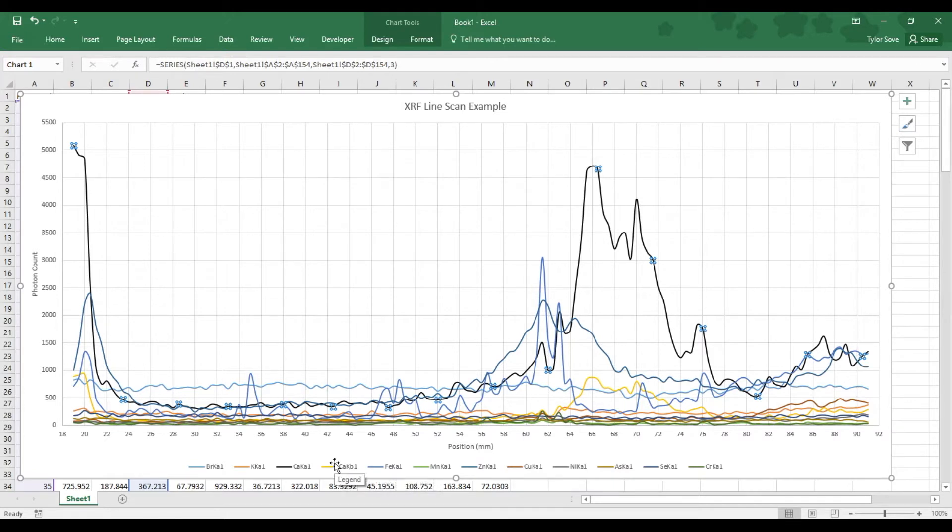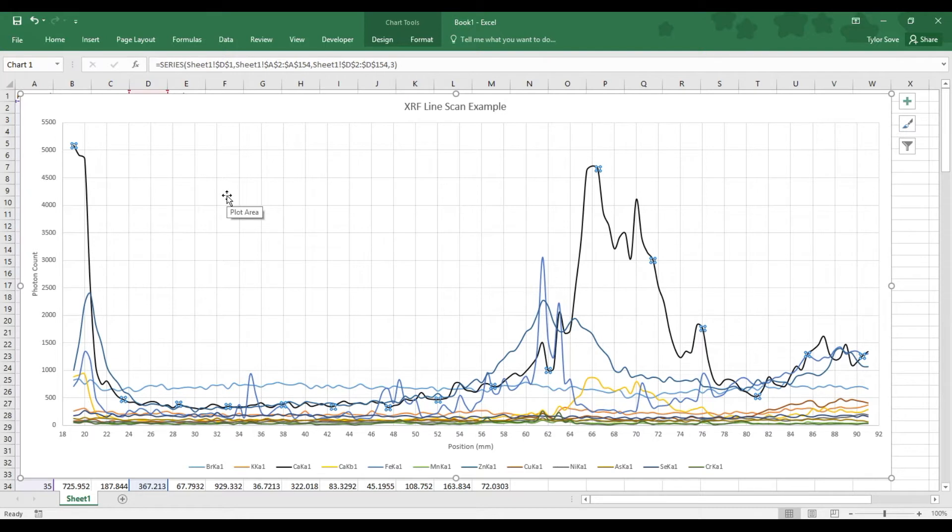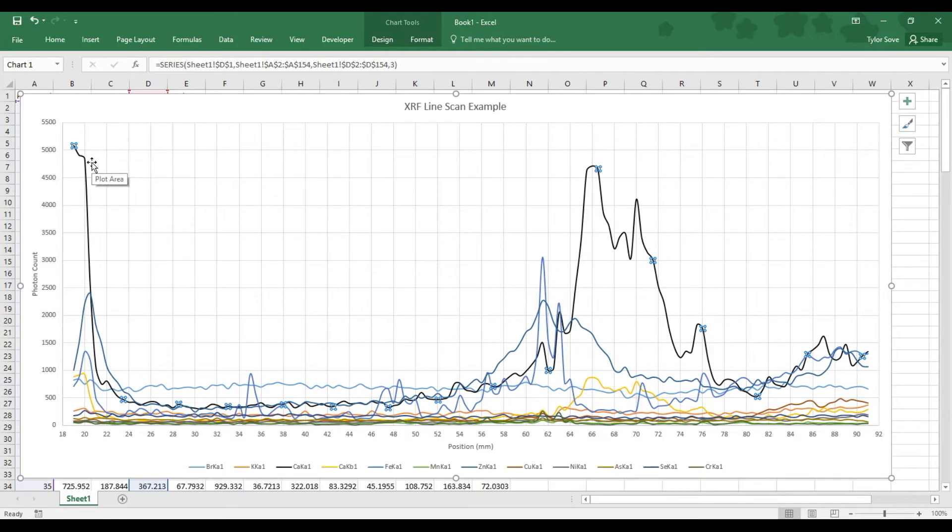Keep that in mind while you're doing your analysis of this graph. You might be looking at the same element, just two different electron transitions that resulted in light fluorescing. When you're dealing with the same element, just two different transitions, the features they have will be the same.